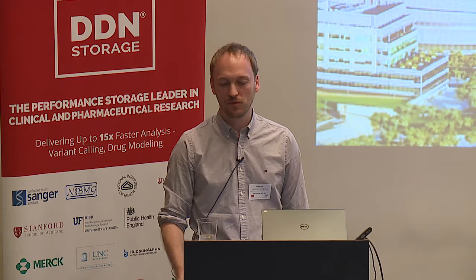I'll ask a question. You said you train networks based on a ground truth that you then try to invert signal for. How do you assess what the limits of that network are? When you need to retrain, how do you know the boundary space of its utility, of what it can be applied to? That's a big challenge. I think it's still an open question how to estimate how far they generalize, how to make sure the network's predictions can be trusted, and how to quantify that. In the paper we have some estimations, some approaches, but it's still very much an area of research that's going to be very important for applying this to come up with scientific discoveries. So that's still open.